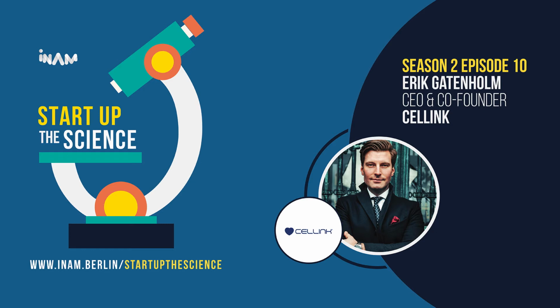Great, thank you. Let's start off with a more general topic. Can you tell us what bioprinting is? How does it work? Sure. So bioprinting is a relatively new technology. It came about 20, 30 years ago when a professor called Professor Thomas Boland essentially invented this great technology. He was working with human cells in his laboratory, and he wanted to find ways to position these cells in a certain arrangement. And what he did was that he looked at a lot of different technologies, and something that he saw was very interesting was he saw a resemblance or the similarities of what a regular paper printer can do in terms of accuracies and positions, and kind of connected those dots and said, well, if a paper printer that prints inks on papers can print these tiny little droplets that are tens of microns, well then perhaps it can also print cells.